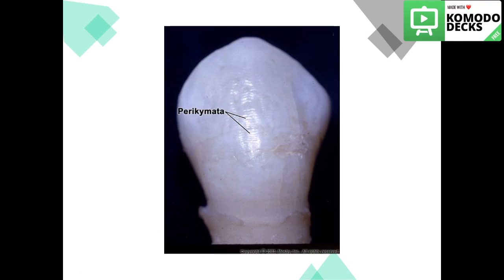So we have finished talking about the phenomena that are seen inside the enamel. Now we will talk about the surface of the enamel. The enamel striae are visible on the surface of enamel as these circumferential running lines that are called perikymata. The ones that are high we call the perikymata ridges, and in between them there are the perikymata grooves. These are seen when the tooth is freshly erupted. They go away after a while with attrition and abrasion.